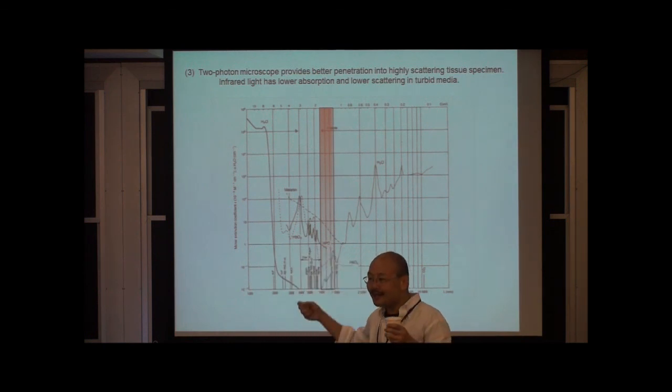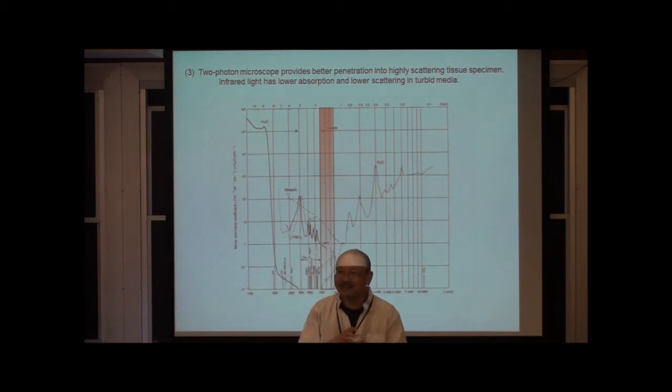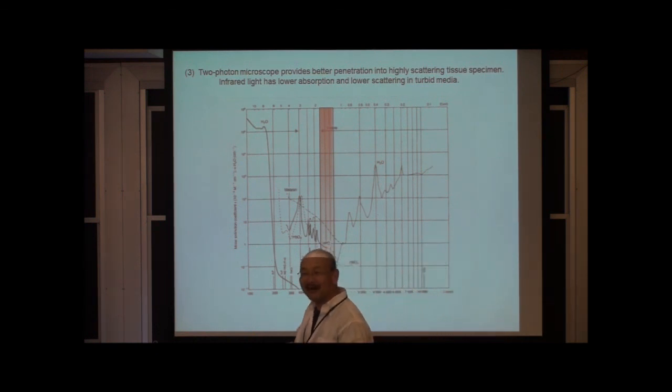When you send the light in, these clusters of protein bounce the light around because they have a similar size to the optical wavelength. And because of that, light doesn't propagate in a coherent fashion through a scattering medium, unless you do something like so-called turbidity suppression. But on the other hand, in most cases, the light doesn't propagate through a turbid medium very well.